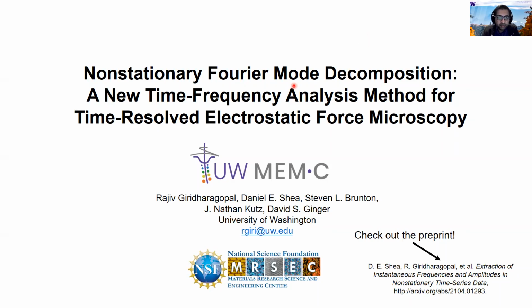Hi, I'm Raj Giridharagopal. I'm a research scientist at the University of Washington, and I'm going to present our recent work in developing a method called non-stationary Fourier mode decomposition, which is a time frequency analysis method that we're applying to atomic force microscopy, specifically in the context of time-resolved electrostatic force data.